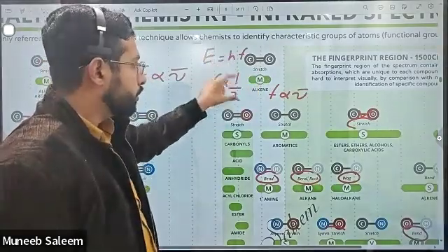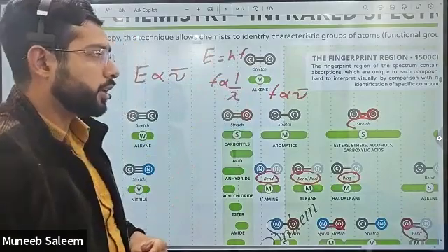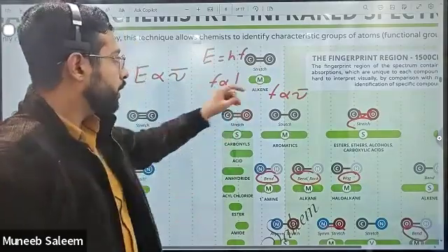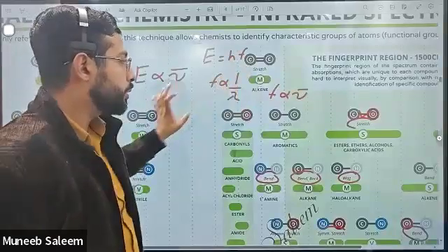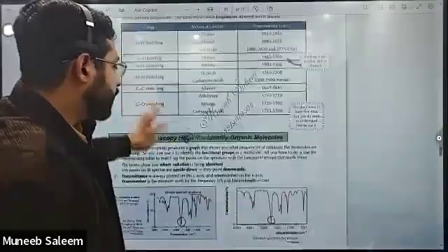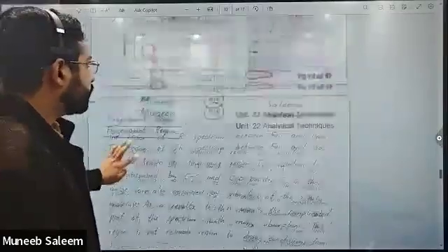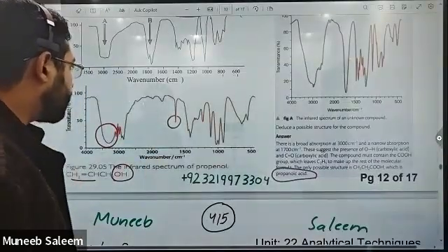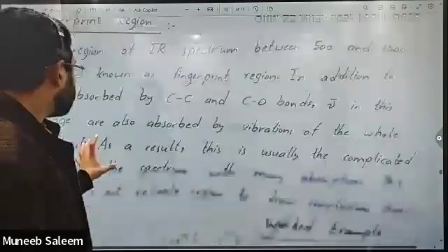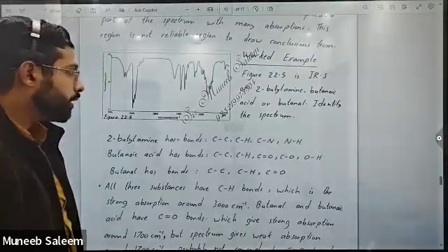So you have to make use of this table as well just to make it clear that it should match with the IR spectrum which you are looking at. The peak of the alkene is basically of medium size. So yes, we do see that the intensity of the peak is of medium type over here, not very intense and not very weak. So this is how we are checking all the functional groups from the IR spectra.